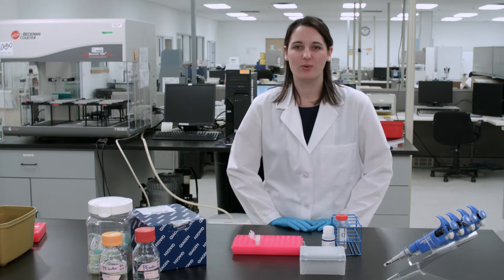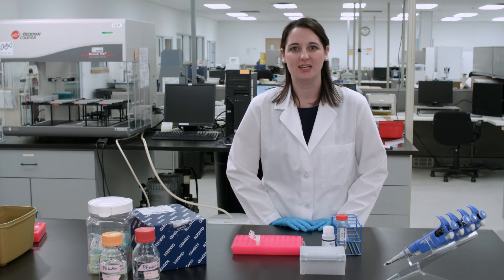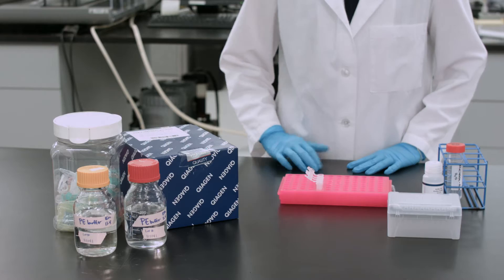DNA quality is the most important factor in the sequencing process. You can prepare your samples with any kit, however we would recommend the kit from Qiagen.